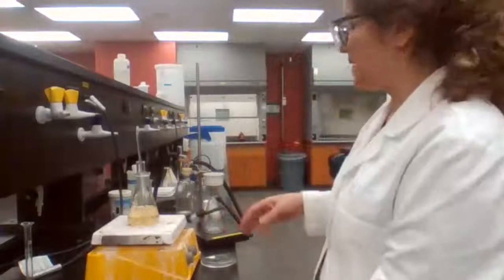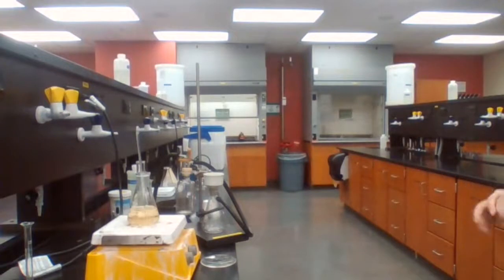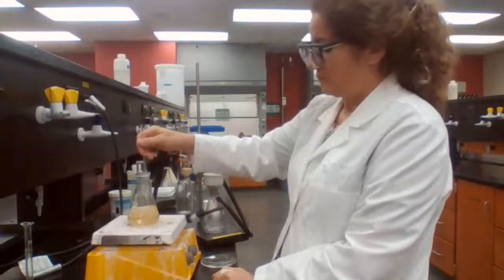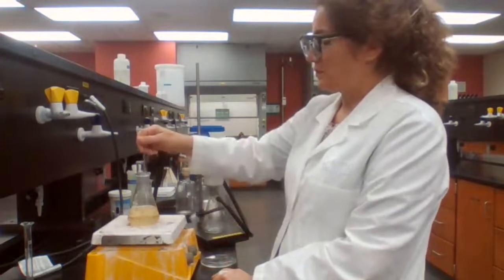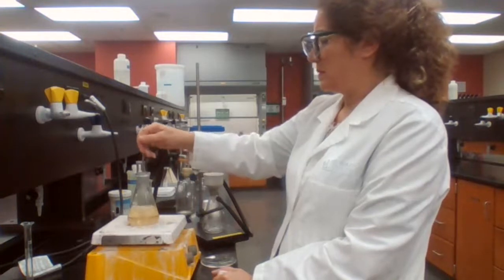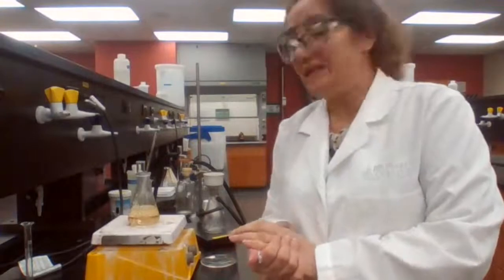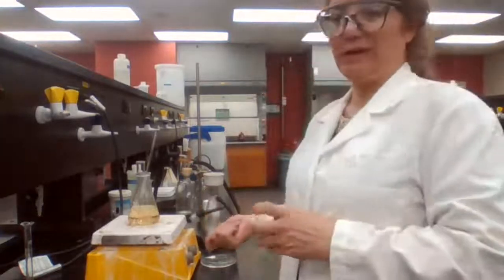It's getting close, but not yet. I have it between 7 and 8 because, since I was moving to the scale, I lowered it to 1 and 2 because I didn't want any splashes while I'm showing you the scale.